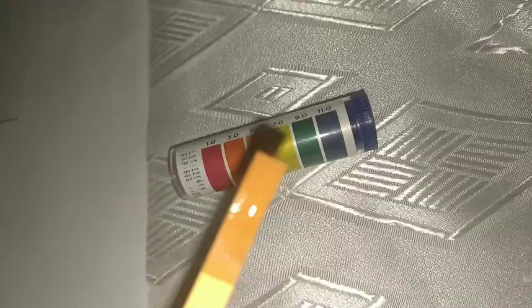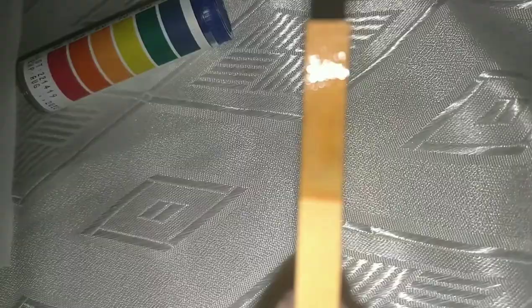Now I'll test the seltzer water. The strip remains yellow. I'd say it matches more with this orange at 5, so we'll say it's a 5.